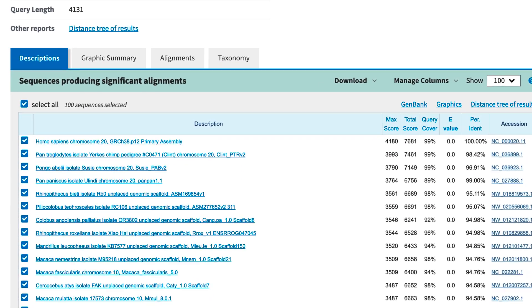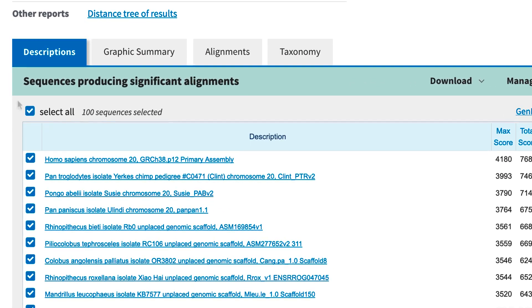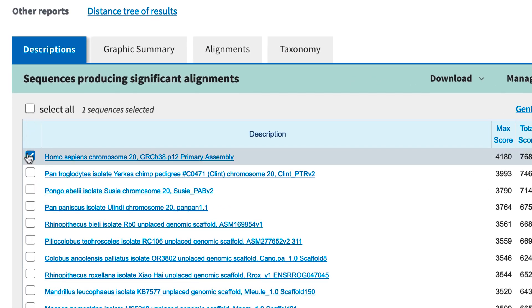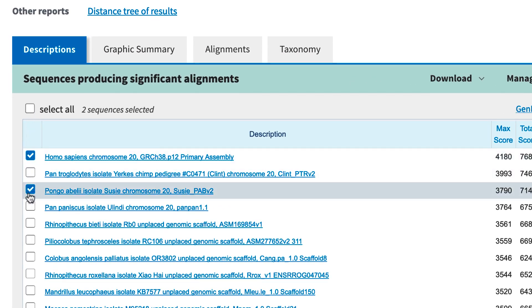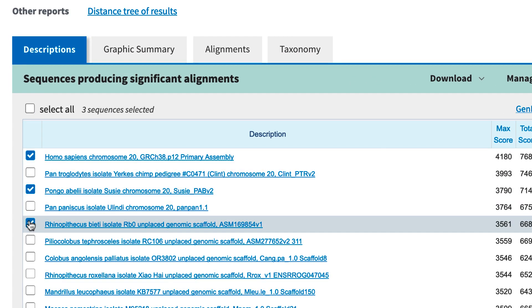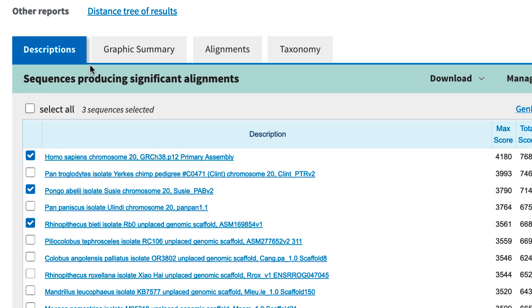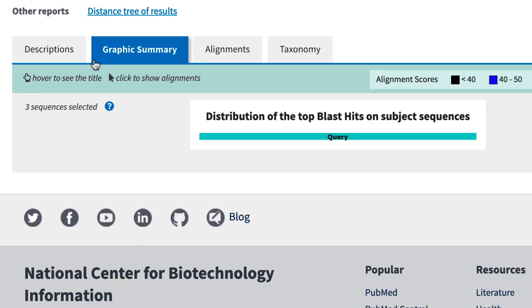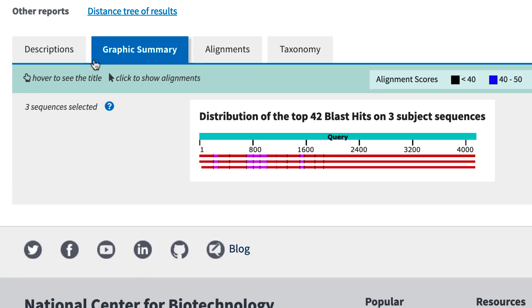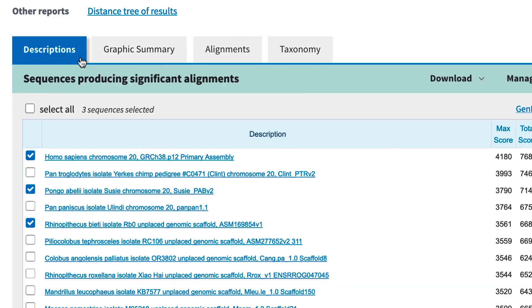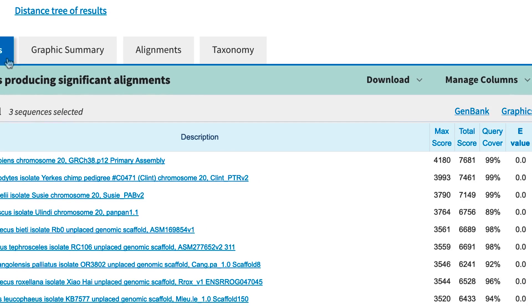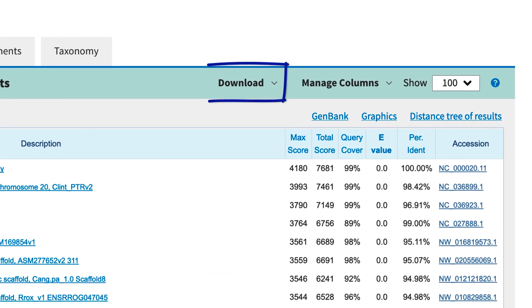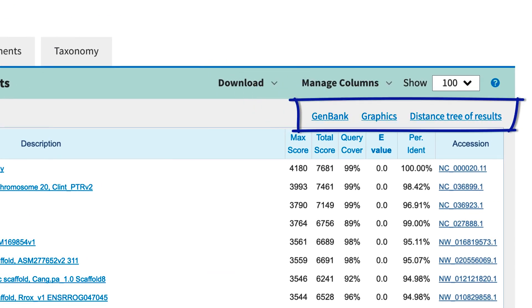One new feature is that selections made in descriptions are carried over to these other tabs: Graphic Summary, Alignments, and so on, and importantly to the Download function, and also to these others, including the Distance tree.